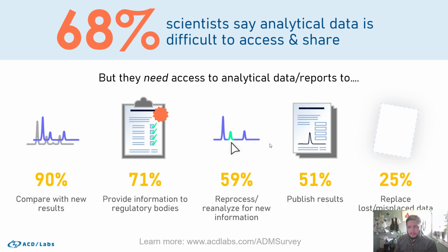But they need this analytical data to do a variety of everyday activities, such as comparing new results to old results, which is a very helpful thing to do to make sure that the results you're getting today are what you expect them to be. You're also providing information to regulatory bodies, so that's 71%. So a lot of these are everyday kinds of activities.